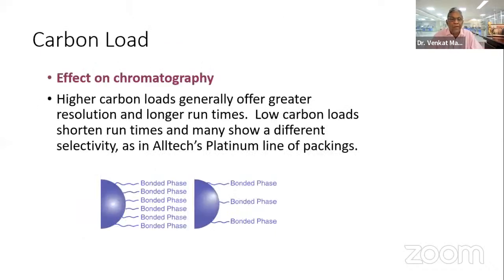Then comes carbon loading. Higher carbon loading generally offers greater resolution with longer run times. So lower carbon loading shortens the run time. Therefore, carbon loading also plays an important role in the bonded phase.